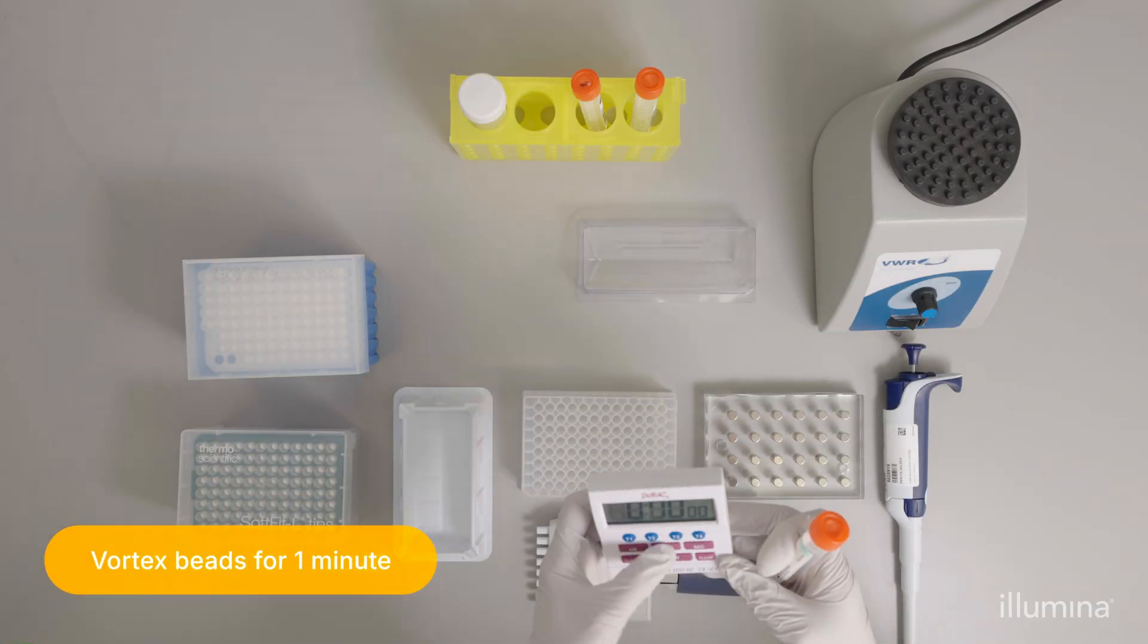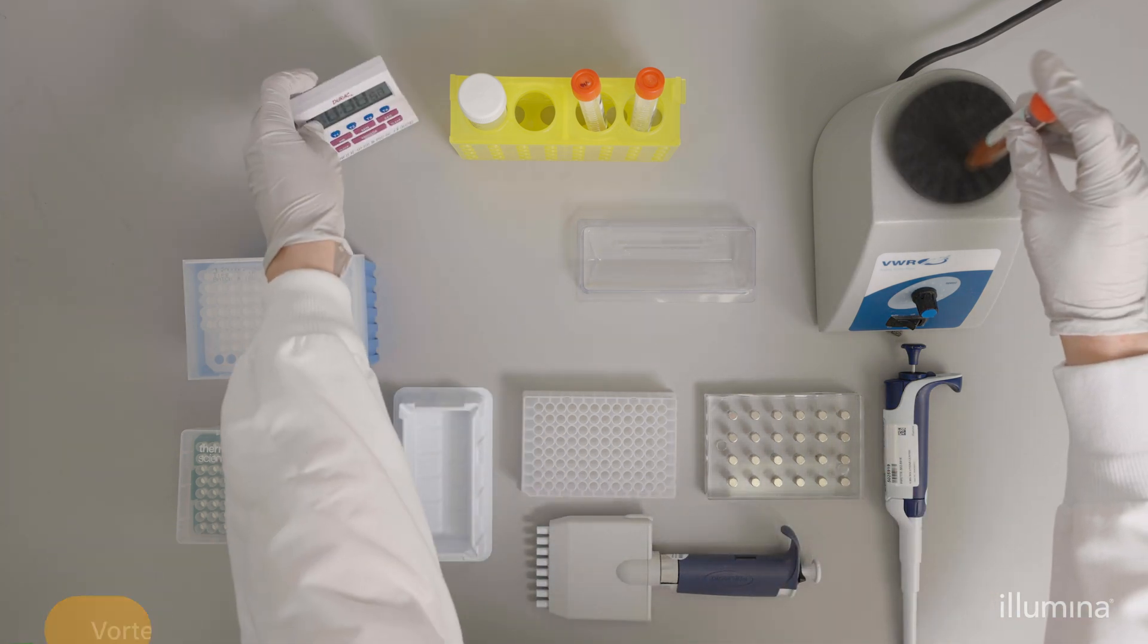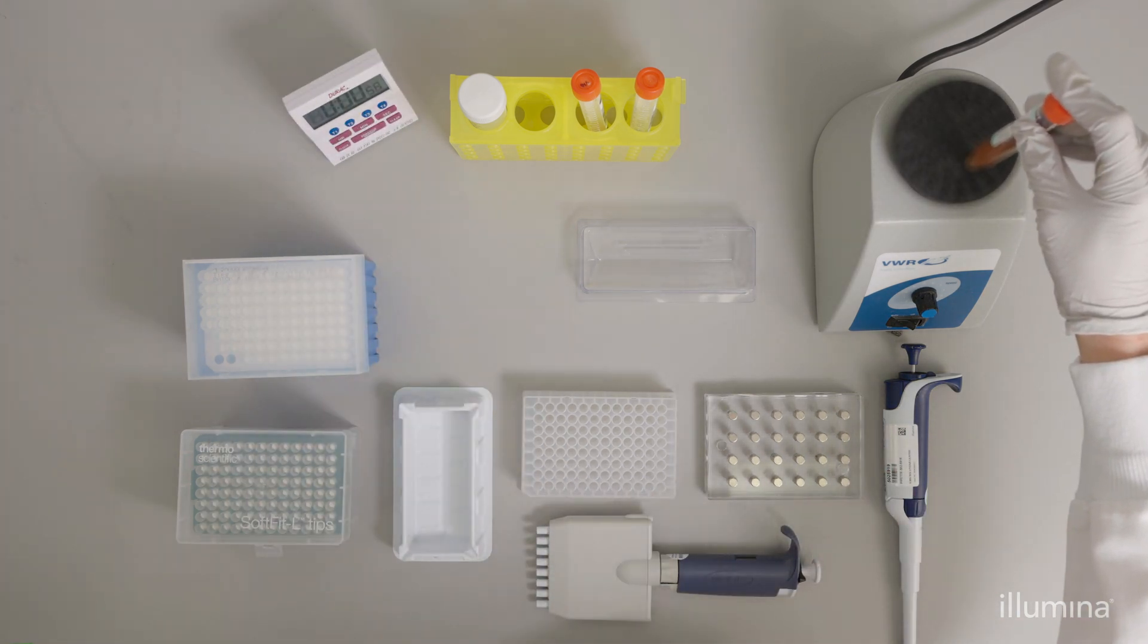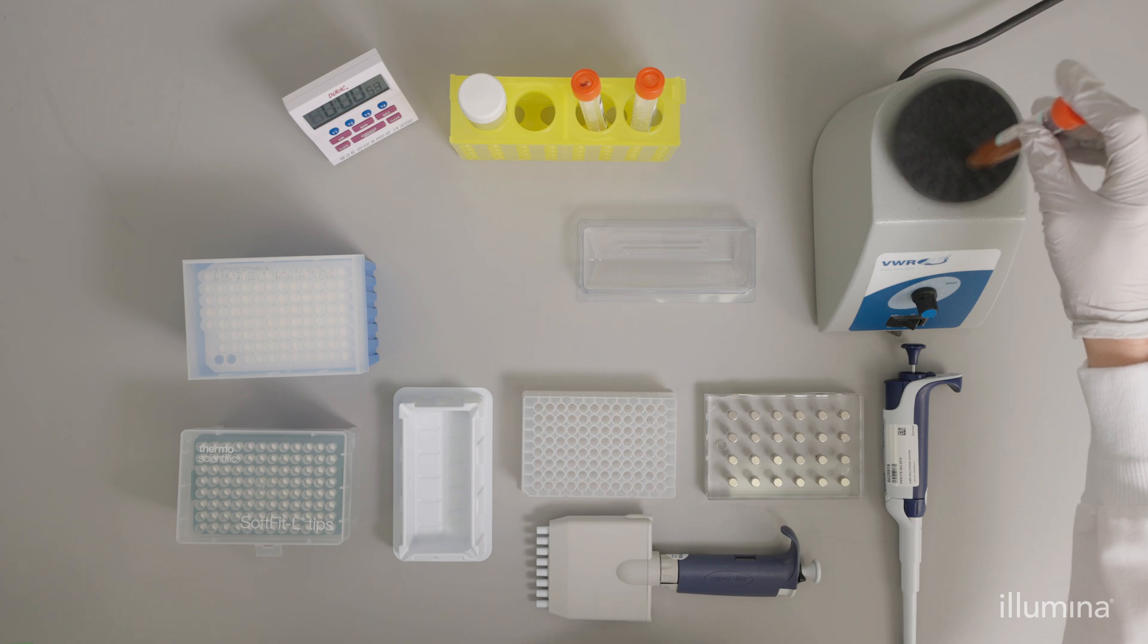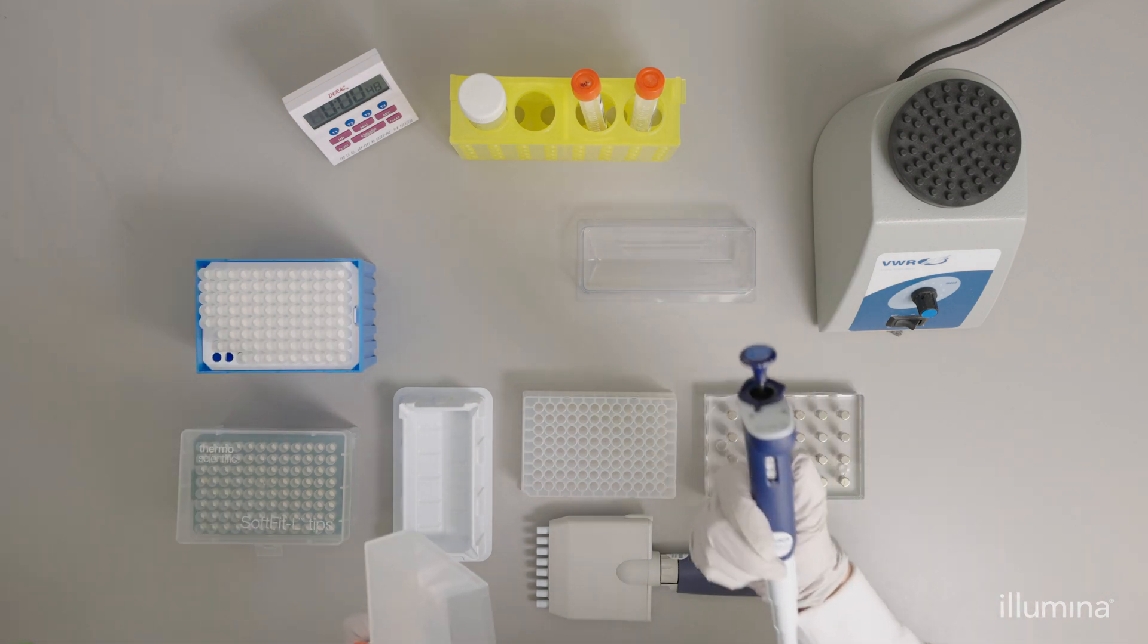When using sample purification beads, or SPB, in this protocol, vortex the tube for one minute to resuspend beads in the solution. Immediately add beads to a trough with a 1000 microliter pipette.